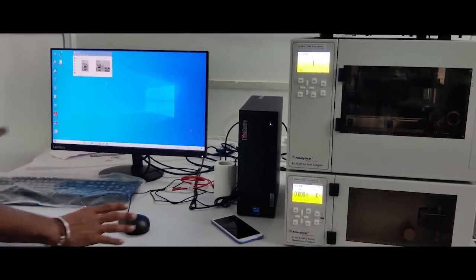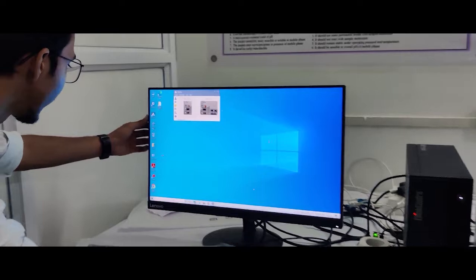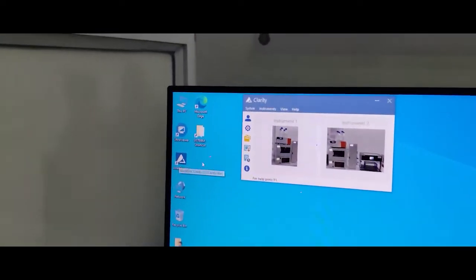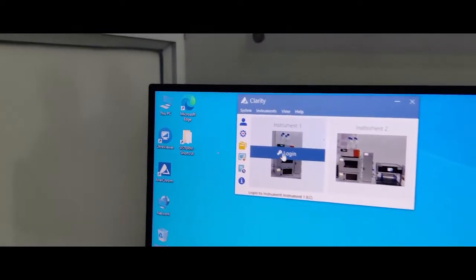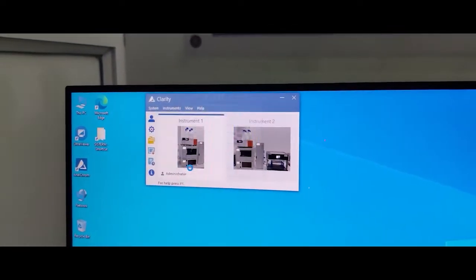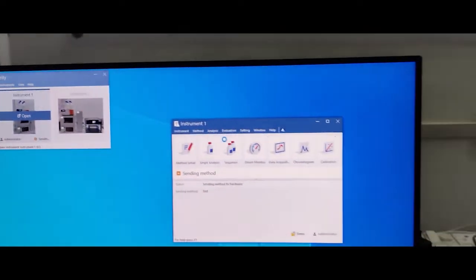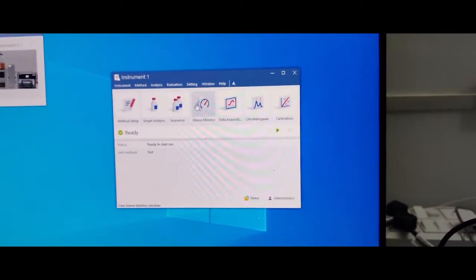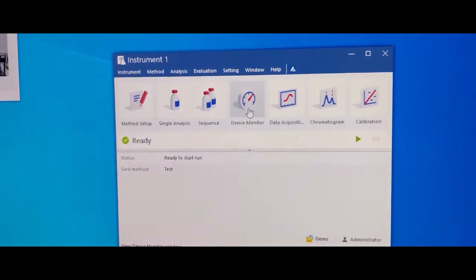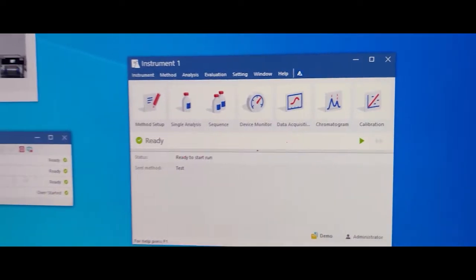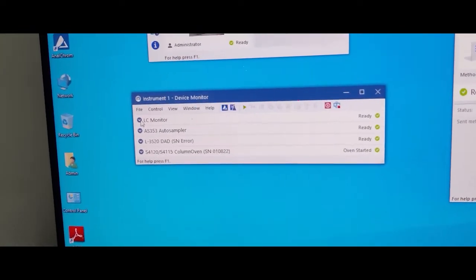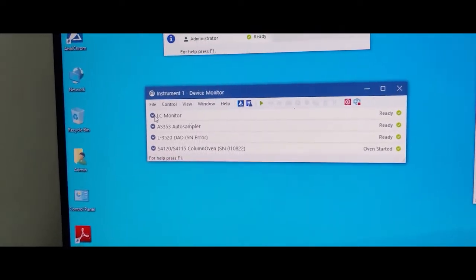This is our ATS software. Go to device monitor. You can check the instrument condition.